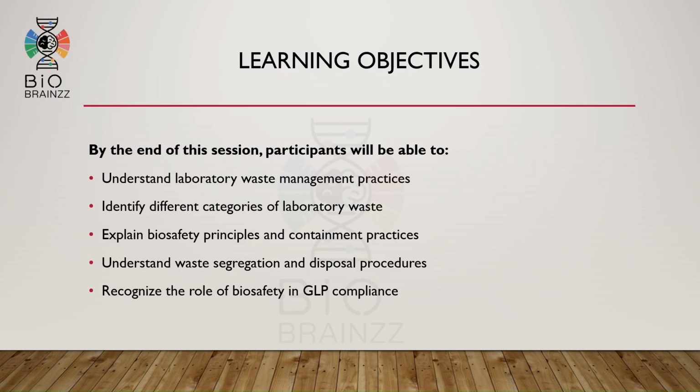By the end of this session, we will be able to understand laboratory waste management practices and to identify different categories of laboratory waste. We will also discuss biosafety principles, containment practices, waste segregation methods, and disposal procedures. Finally, we will understand how biosafety supports GLP compliance in laboratories.